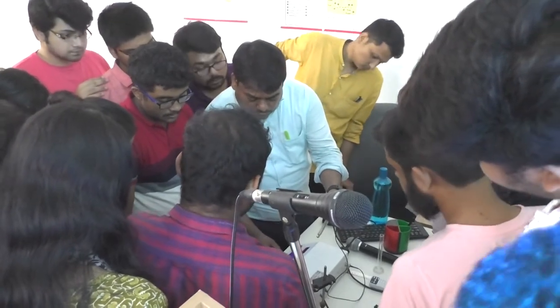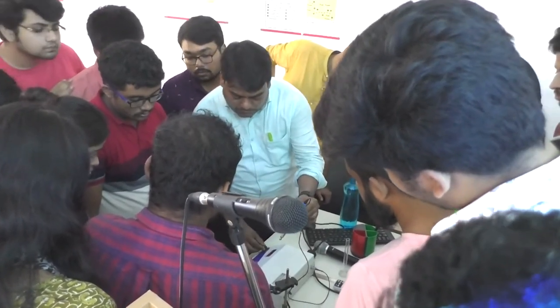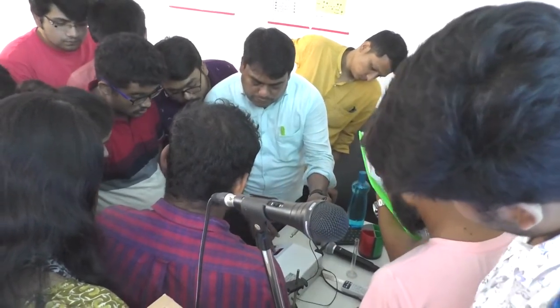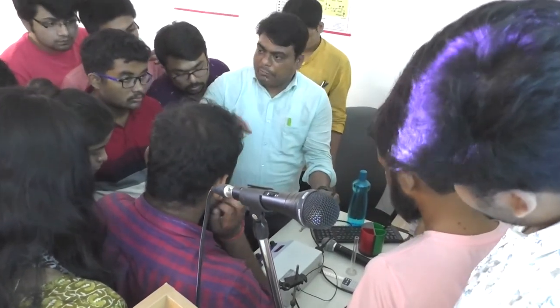From this, first of all you will calibrate this by the slope. You have to select the pH and bring this to the range of 4.0 by maintaining the temperature also, because temperature fluctuates the pH.